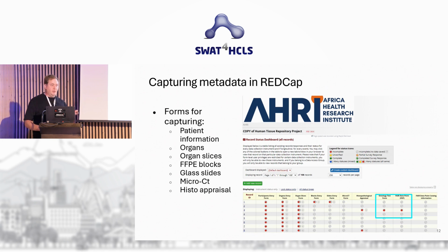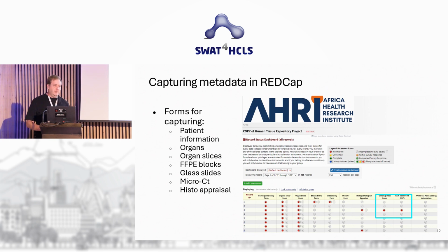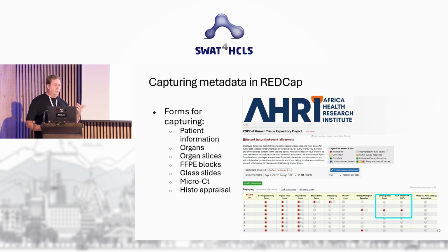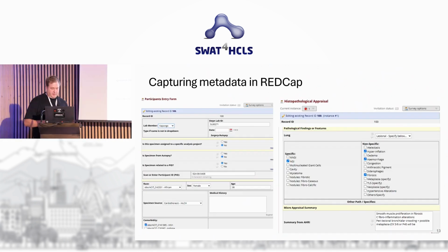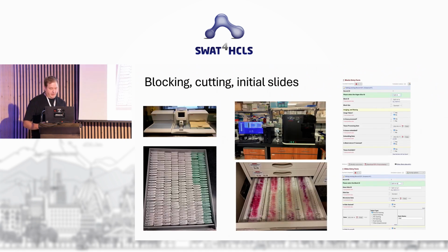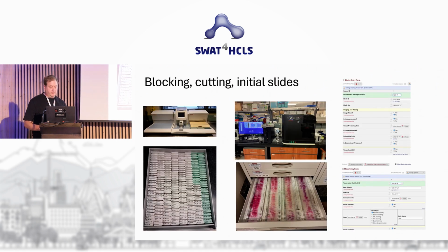One of the reasons I'm mentioning it is this is being used to capture all the data from that population study of 100 or so thousand people in Matuba. And at RE, there is a team that is very capable and knows the system very well. It's fairly versatile. You can also use it in the field on a tablet. You can use it in offline mode. And in our lab, we've barely scratched the surface of what we can do with this. So this is just an example of what the forms look like. We have a form for the histological appraisal and for the blocking and the cutting initial slides and so on.